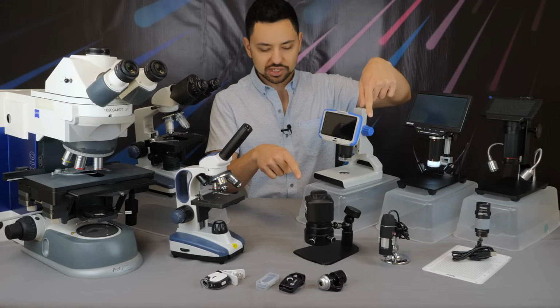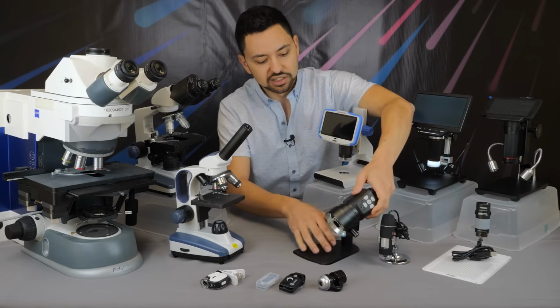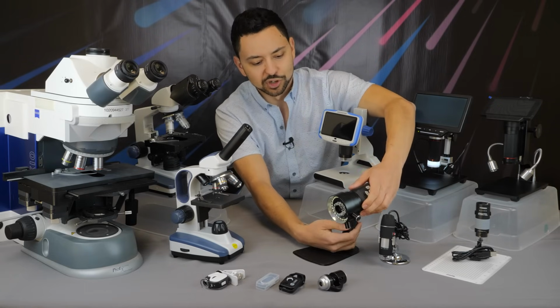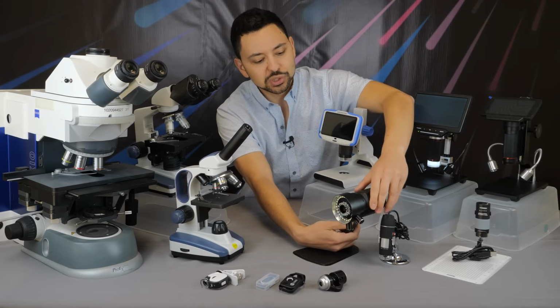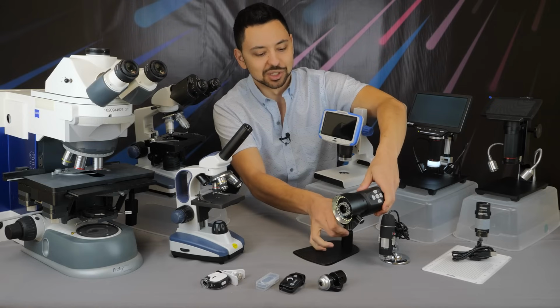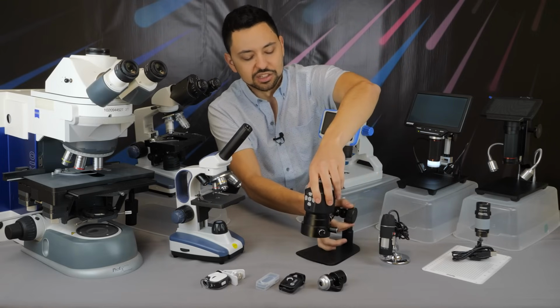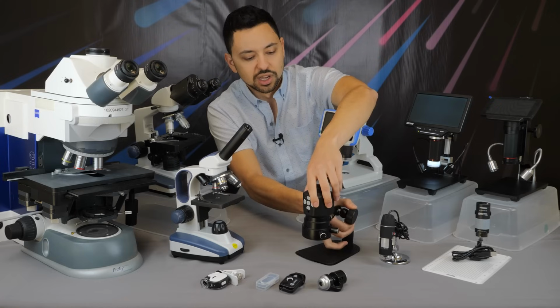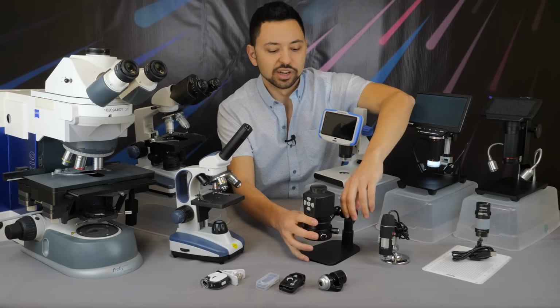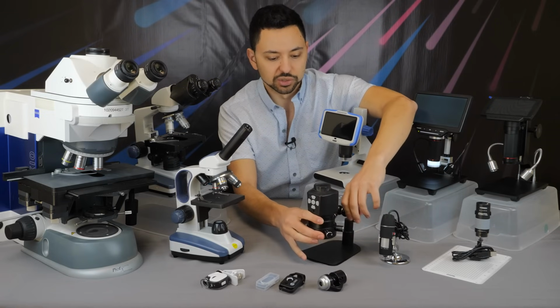This microscope down here I wanna talk about a little. It's an interesting microscope. It is an Amscope microscope. The quirk here is that it's on this rotatable, positionable arm, so if you want to look at something that is vertically positioned, you can do that. Sounds really good on paper, but as it turns out, it's extremely rare that you need to position the microscope in a weird way. If you're doing some industrial application, this might be a little bit more useful. For me, I've basically never used that functionality, and it's just more inconvenient to try and get the right focal distance for this microscope.